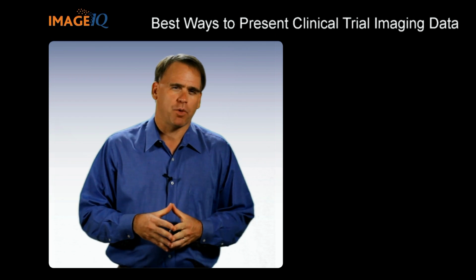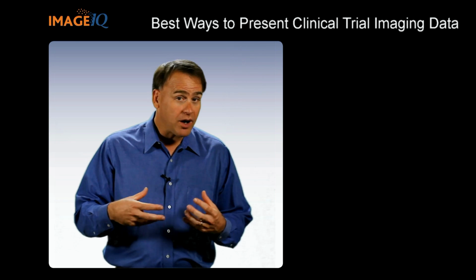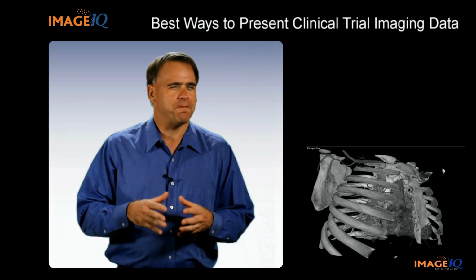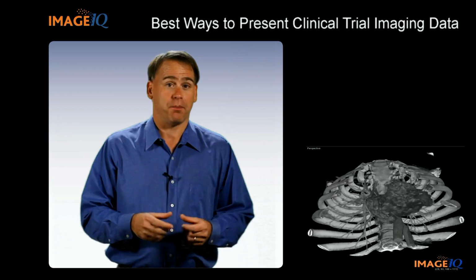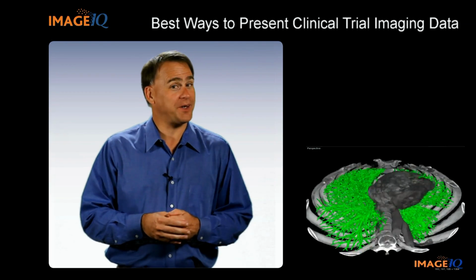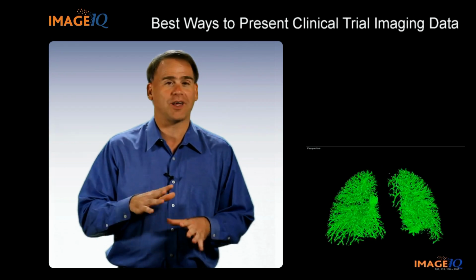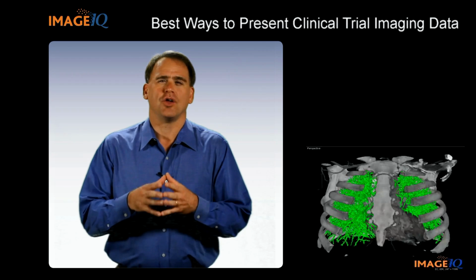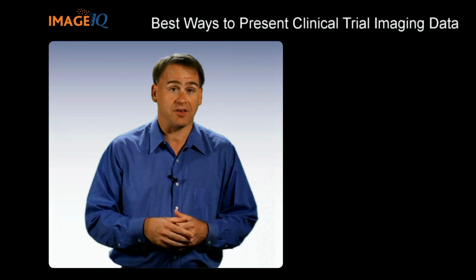You know, it's kind of funny. When you're in the business of image analysis and imaging software like we are, you have the ability to make some very beautiful pictures. The visualization that comes out of this quantitative data can be very compelling, but unfortunately, that's not going to help get you through an FDA audit or an academic paper submission or give you all the insight you need as you make scientific assessments. You need to provide the associated data. And we're going to cover a few things that you can do.